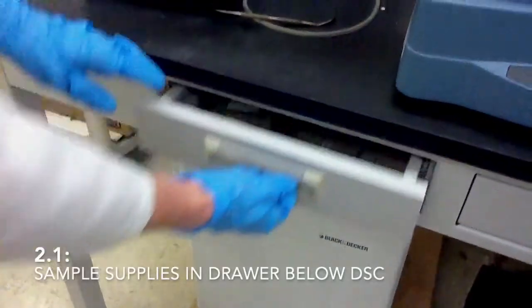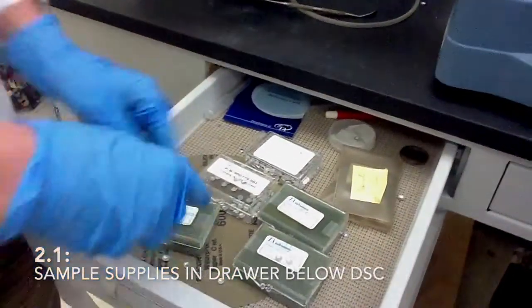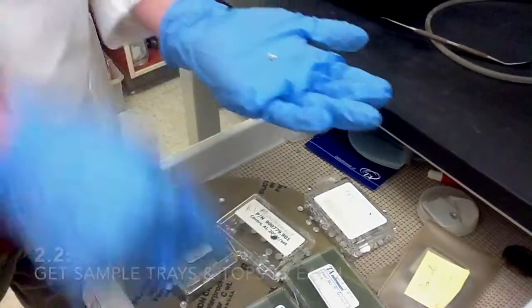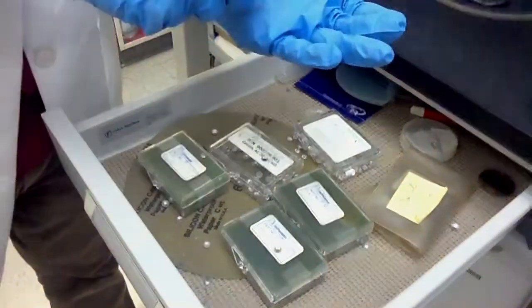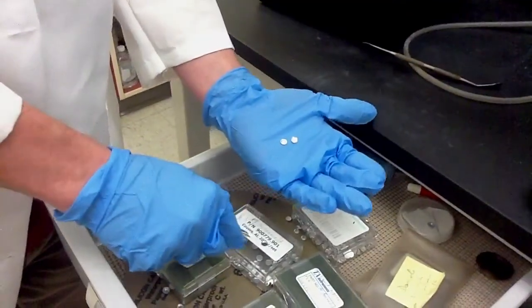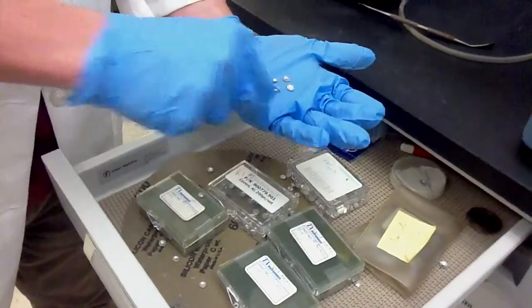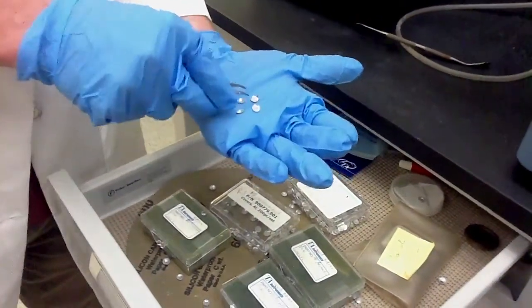For sample preparation, we're going to need two parts. We're going to need this bottom part and then also a top part here. In fact, I think we're going to need two of these. And then we take these over to the scale.